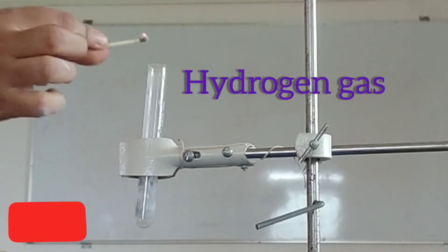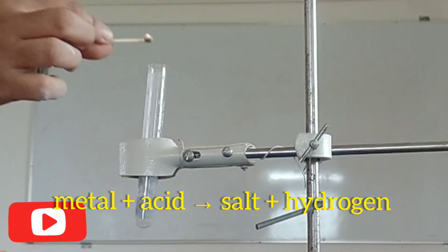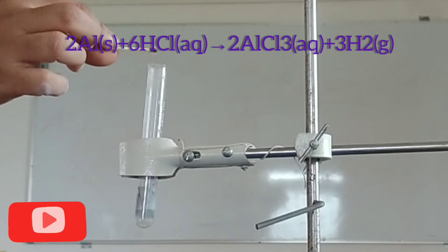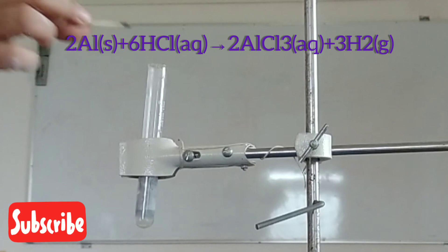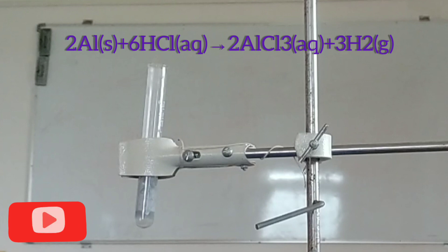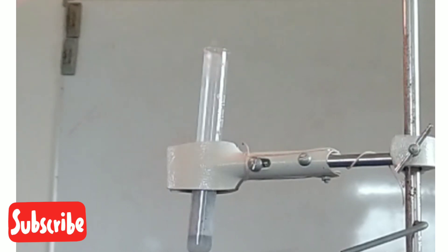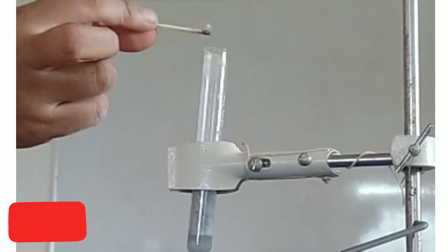When metal reacts with an acid, metal salt and hydrogen gas is produced. So in this case, we have taken aluminium and hydrochloric acid. Aluminium reacts with HCl hydrochloric acid to give aluminium chloride and hydrogen gas is liberated. This hydrogen gas burns with a pop sound.